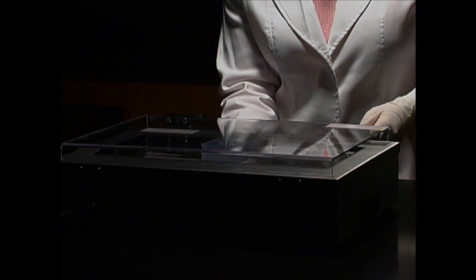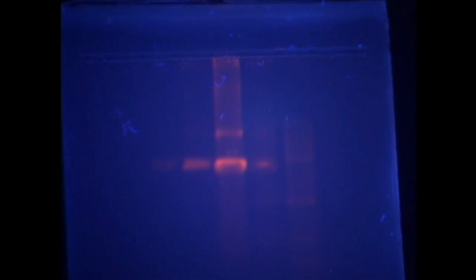When struck with the ultraviolet light of the transilluminator, the dye in the samples will luminesce. You should be able to see a band of the D1S80 polymorphic region having traveled partway through the gel. How far it travels depends on how large the region is for each individual.